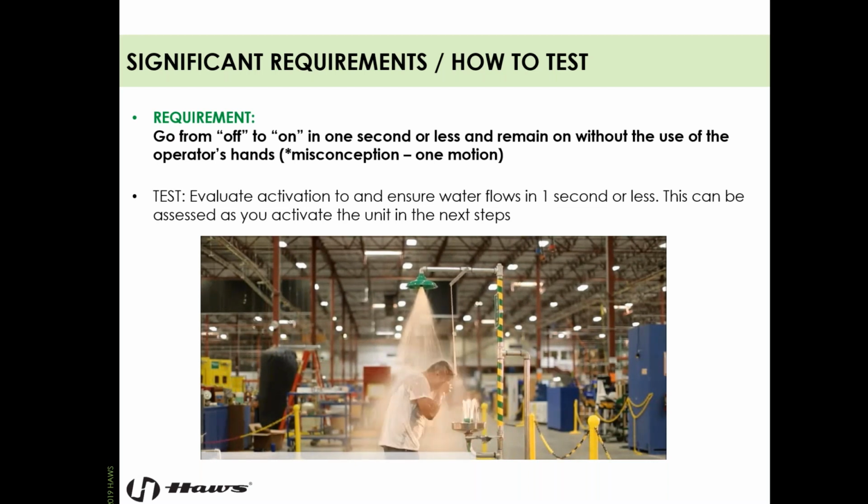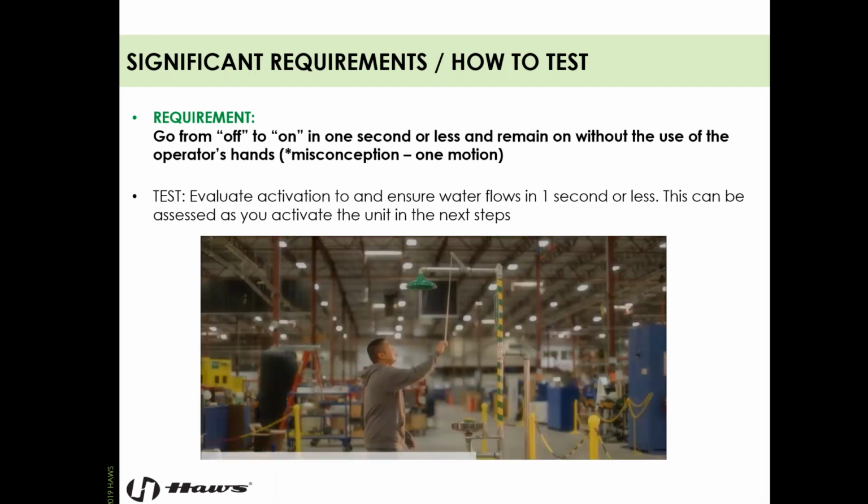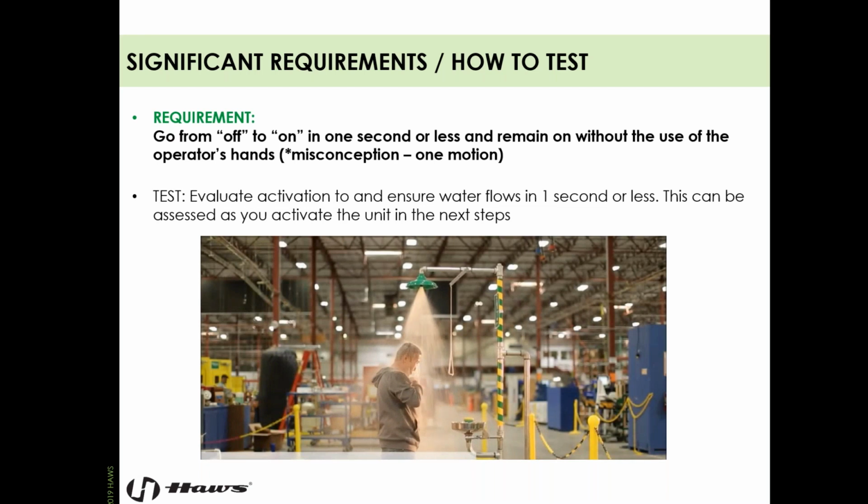Now, it needs to go from off to on in 1 second or less. So upon activation, just make sure that the water is in fact activating at the heads of the device very quickly. And make sure that there are no self-closing valves in place. Okay, they are usually identified with a large spring on the valve that will slowly close it after activation.